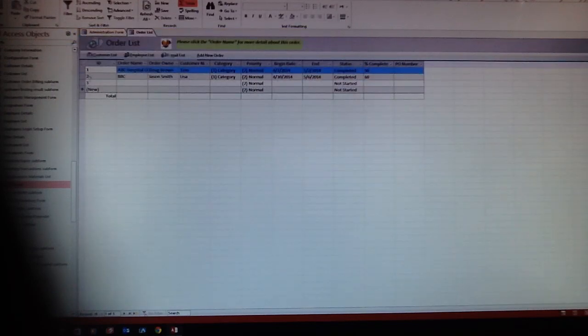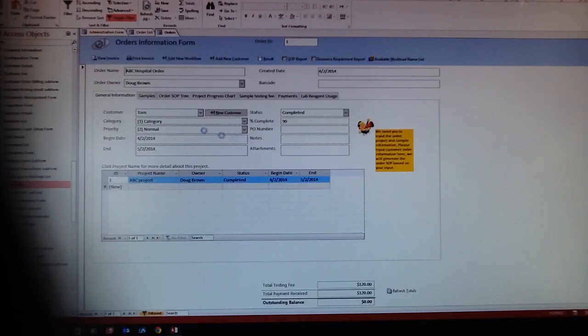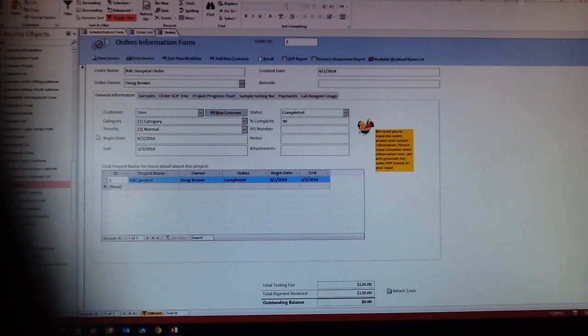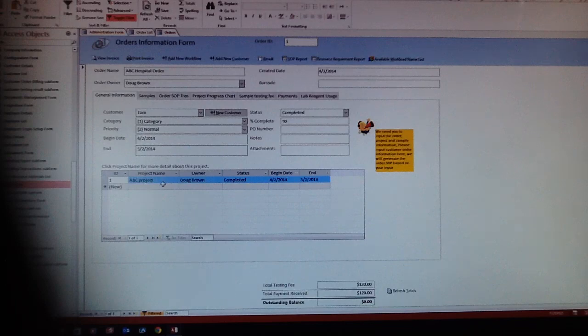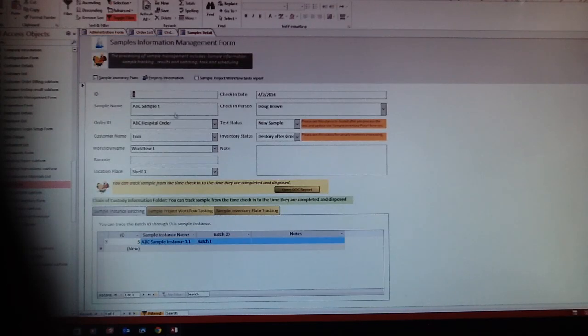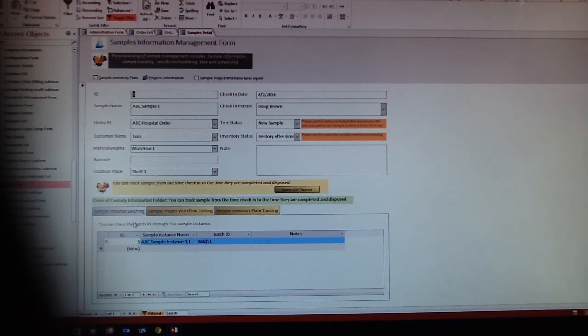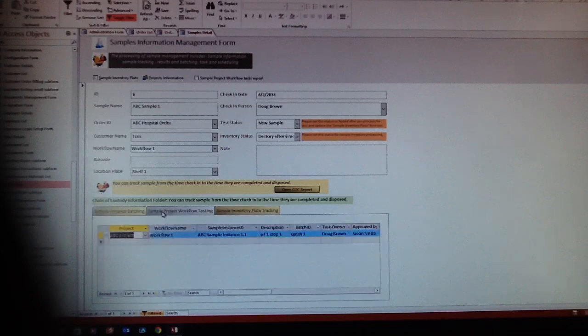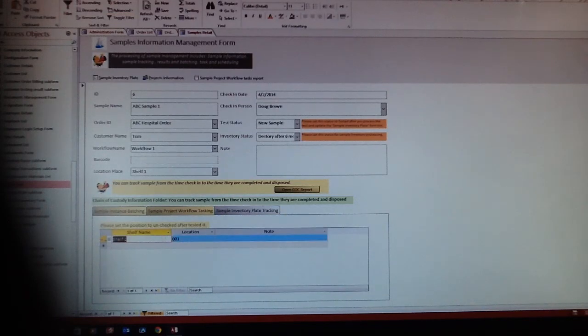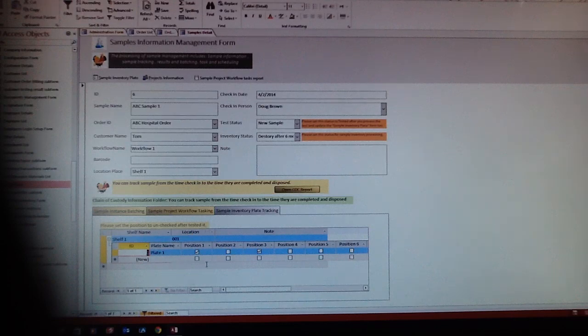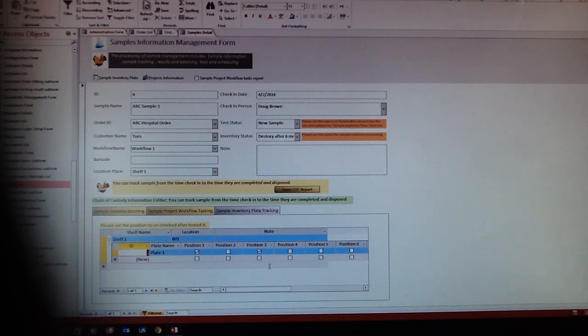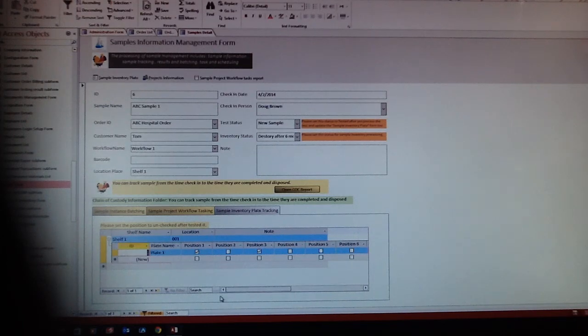Double click and you will see the order. That's the order general information: customer names, priorities, what kind of project involved with the workflows, and what kind of sample involves workflow. You can input your sample information here. After that, you have the sample, sample instance batch, project involved, inventory place. You can put shelves, place one, place two, place three, and they will tell you whether you're going to destroy it or keep it.